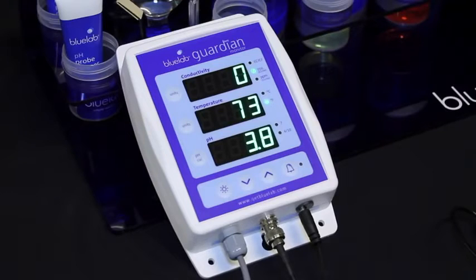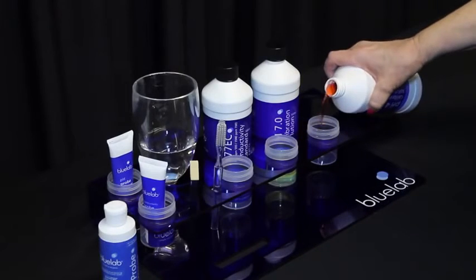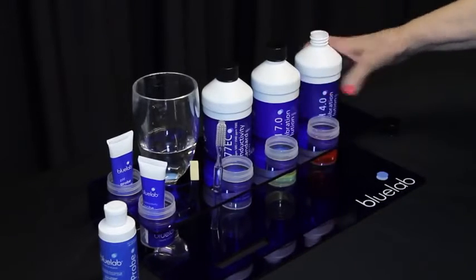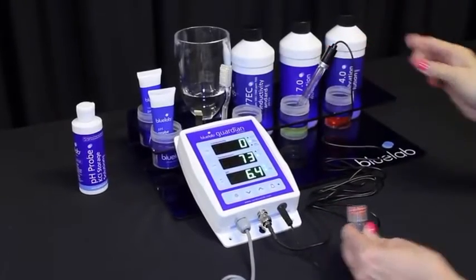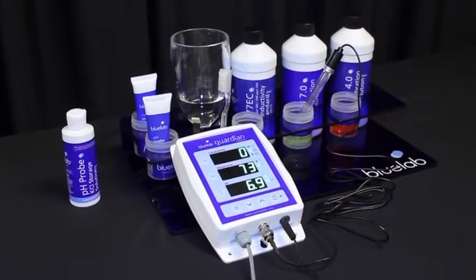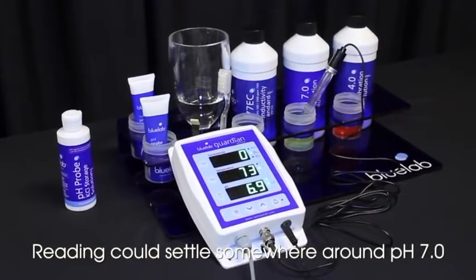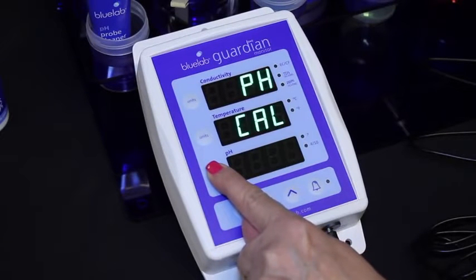The pH probe needs to be calibrated to the monitor before you take readings. Calibrate your pH probe to two points for accuracy. Use freshly poured pH 7.0 and pH 4.0 calibration solutions. With the Guardian plugged into a power source, place the probe in pH 7.0 solution. Be sure to wait until the reading has stopped moving. Press and hold the pH cal button until the display shows pH and cal on the top two displays.